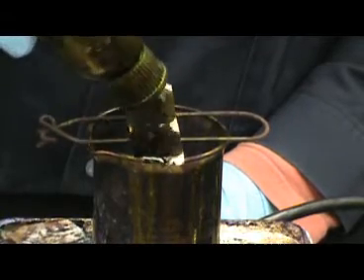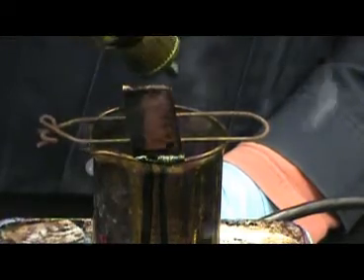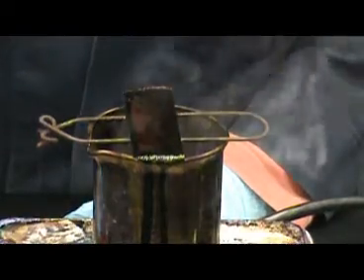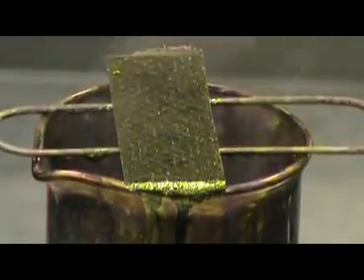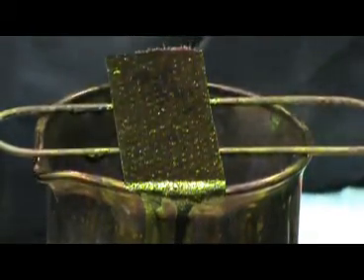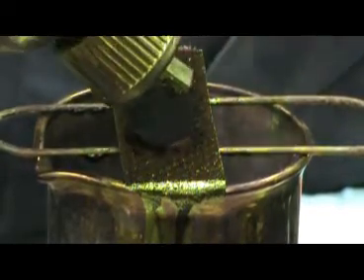The slide will remain over the steaming water for approximately 5 to 7 minutes. It is important to observe the staining process during this time to prevent the slide from drying out. When the stain begins to dry out on the paper towel, this greenish metallic color will be present. A few drops of carbol fuchsin should be added at this time. The slide should be checked every 1 to 2 minutes.